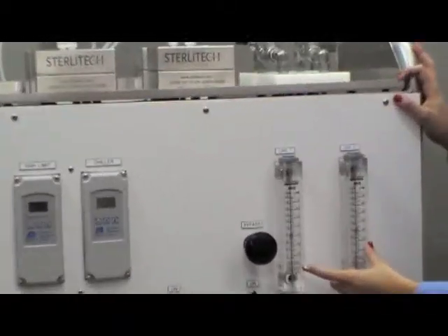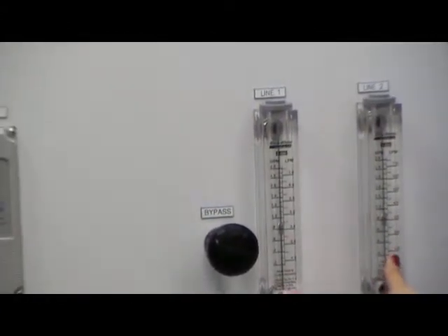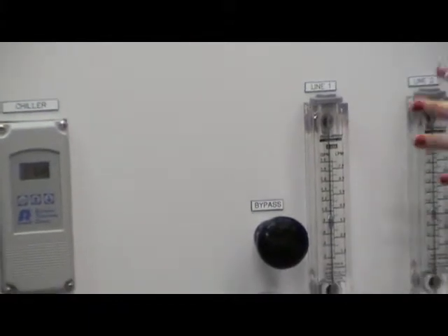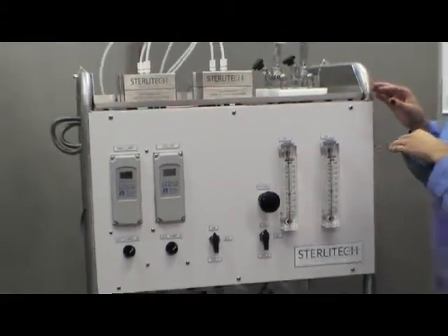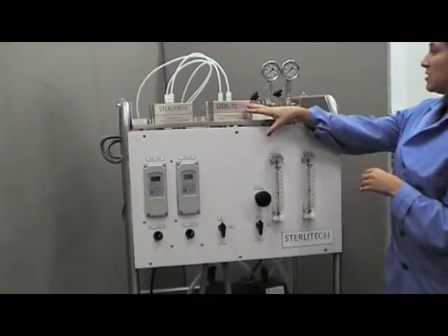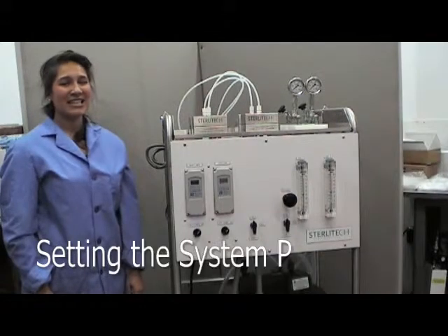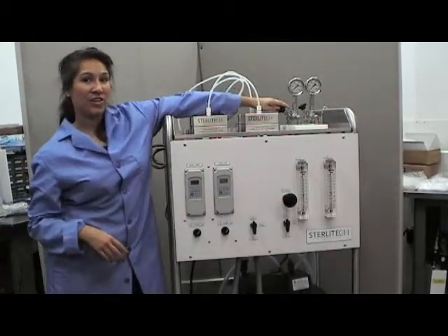You can see the readings on the flow meter are both going to be the same. They're currently reading at about 1.0 gallons per minute. The entire system is open which means you currently have flow running through your bypass as well as through the cells and feeding back into your collection tank in the back. We can set the system parameters by adjusting both the bypass valve as well as the concentrate control valve.